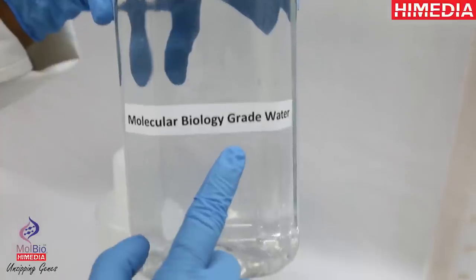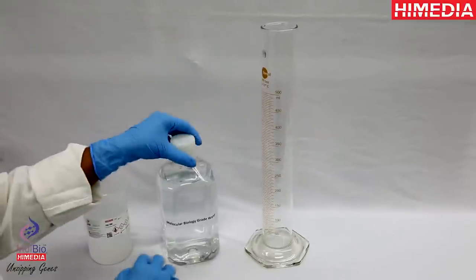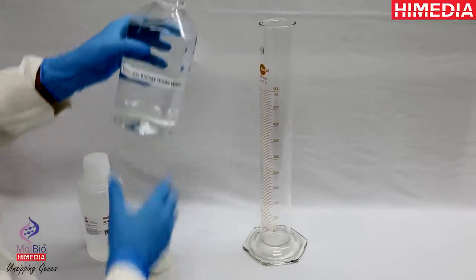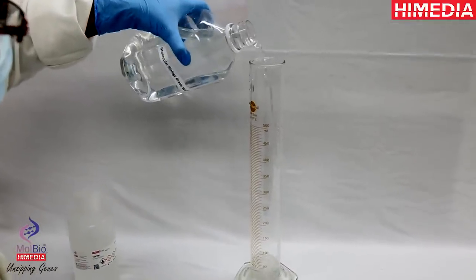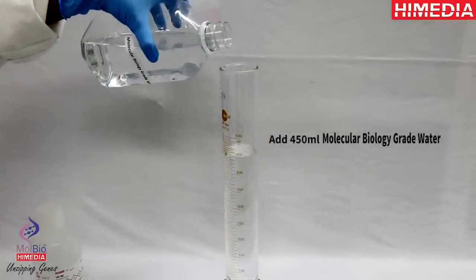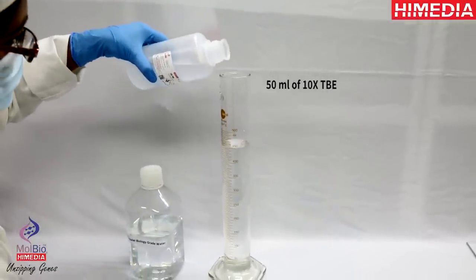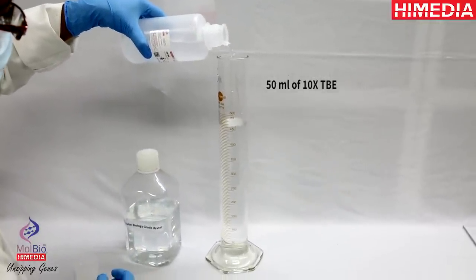10X TBE. Add 450 milliliters molecular biology grade water, 50 ml of 10X TBE.